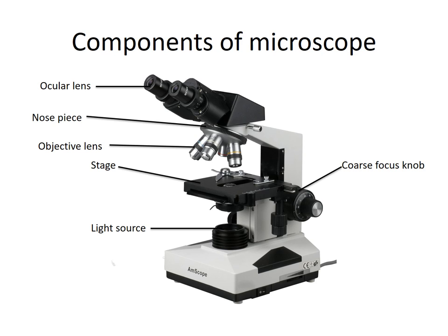To focus the image of the specimen on the slide we have two different focusing knobs. First is the coarse focus knob, which is going to change the focus drastically. For more subtle changes in focus we have the fine focus knob, which is the smaller knob. We've already discussed the base — this is where one hand goes when we move the microscope, and our other hand holds the arm.